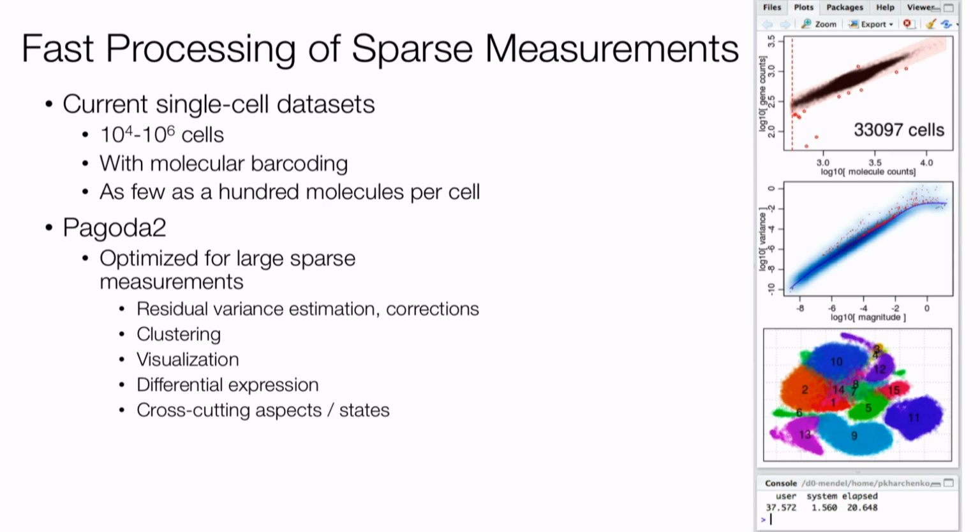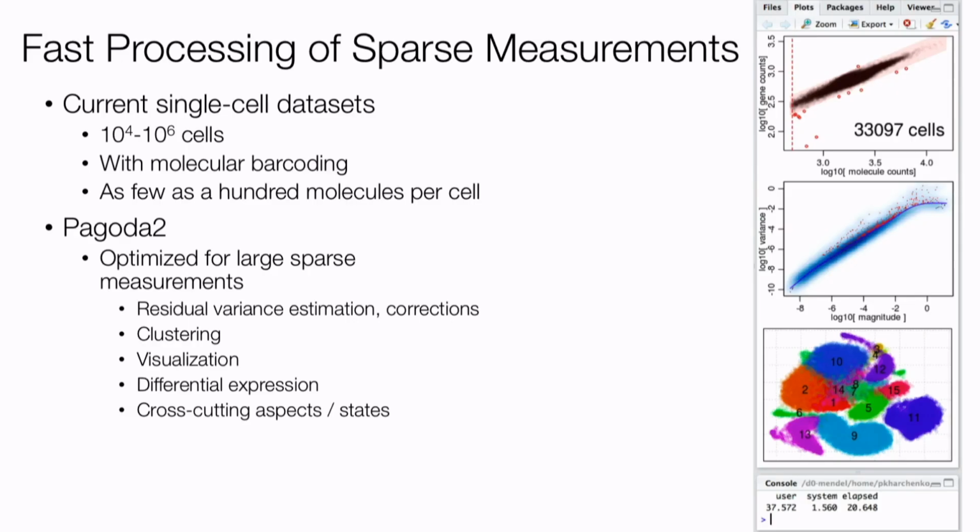Now, but the genes in the cell, the expression levels, are sort of exponentially distributed. Some are extremely high, others are extremely low, and it doesn't directly correlate with the biological importance of it. In fact, if you look at the dependence of the variance on the log scale with magnitude, you will usually see these types of trends where the highest variance is naturally attributed to the highest magnitude, average expressing genes. It doesn't directly follow a Poisson distribution.